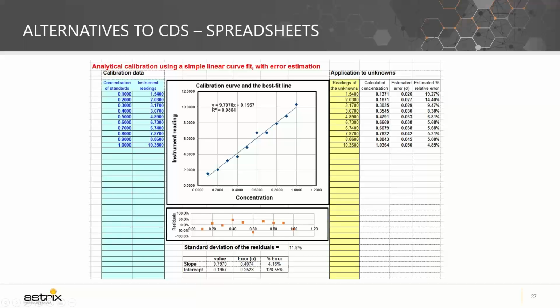So another option, we still have spreadsheets. All companies at some point in time use spreadsheets. So before performing any chromatographic calculations with a spreadsheet, let's remember the general considerations for calculations that Hannah mentioned earlier, and then answer the following question. Which of the general considerations are matched within a spreadsheet, like control access or other considerations that Hannah mentioned?